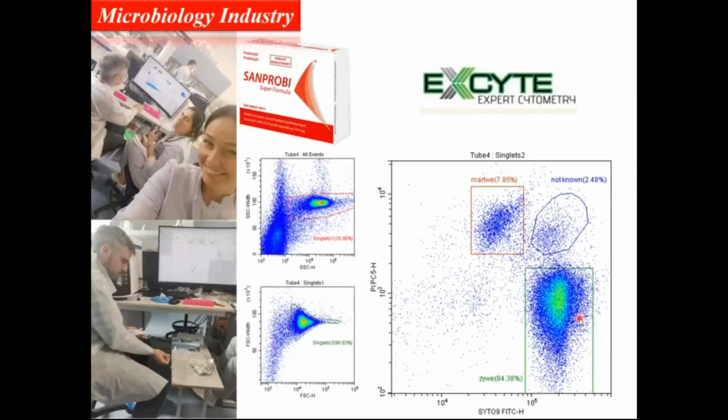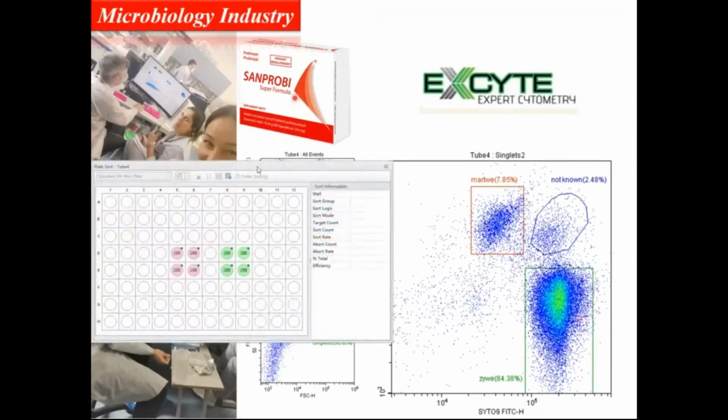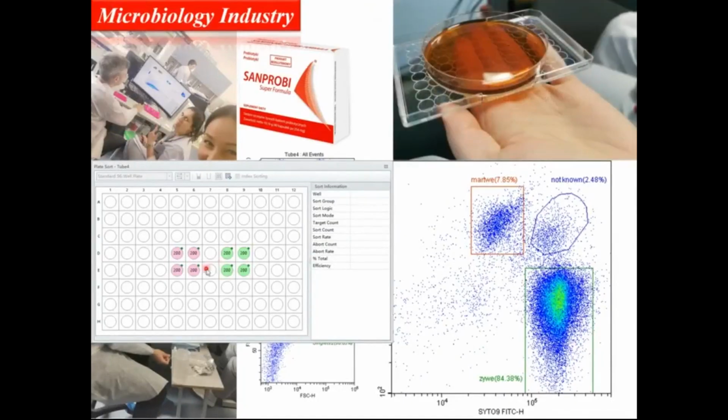So can we use different medias, and if we change medias, will they grow? In this case, what we wanted to do is single cell cloning, but we want to collect 200 bacteria into each one of those positions. Usually we have agar plates to grow bacteria, right? So what we will do is put this into an agar plate. You can see an agar plate, we just have the holder, and this helps us to localize the positions of the groups that we are sorting.